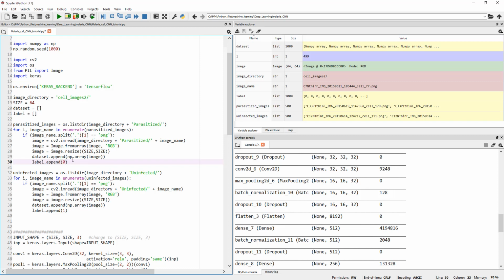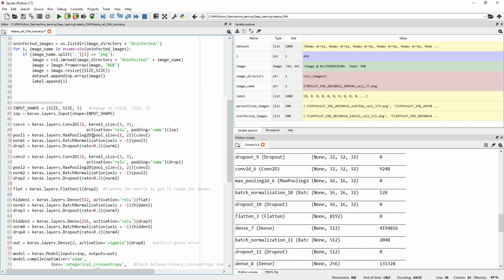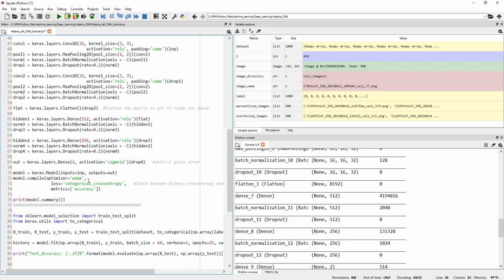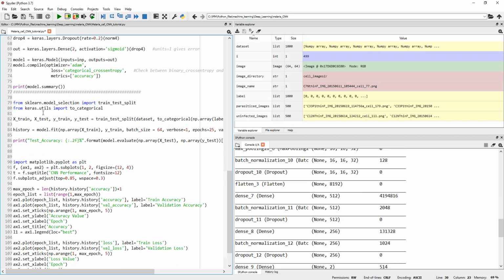And then what do we see? We went down, looked at the image, I mean, we resized it, and then we defined our network. Again, you can look at the network here by printing it out. So we printed the network, and we split our data into train and test, and then we are feeding the training part into the model down here.